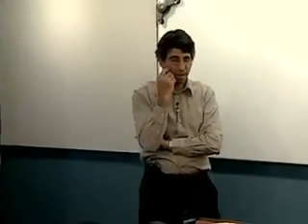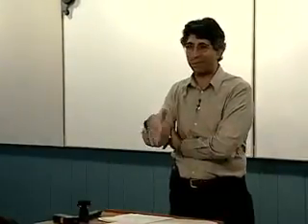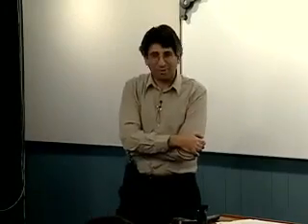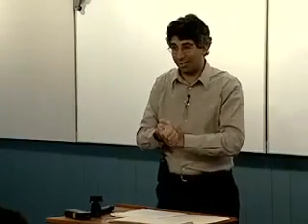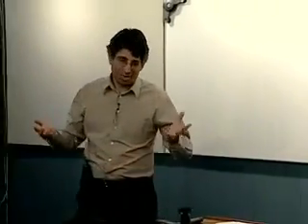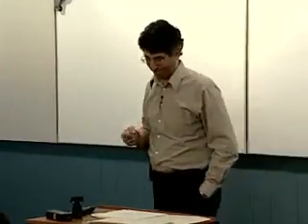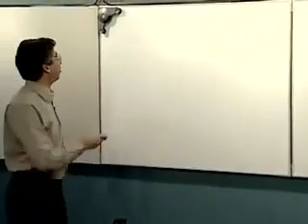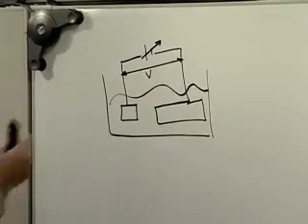We're going to start this off by building what my students last term called a MacGyver potentiostat. You know, I'll remember this TV program MacGyver, and this guy, you know, could get himself out of any problem with a few kind of household items by building some sophisticated thing. So if you're locked in a closet and your life depends on being able to do an electrochemical experiment under potential control, and all you have available is some wire and maybe a power supply and a couple platinum electrodes, of course, then how are you going to go about doing it? Okay. So what you might do, let's see, is, oh, you need a beaker also and some electrolyte. We'll give you that also. So you have some salt water here in a beaker.